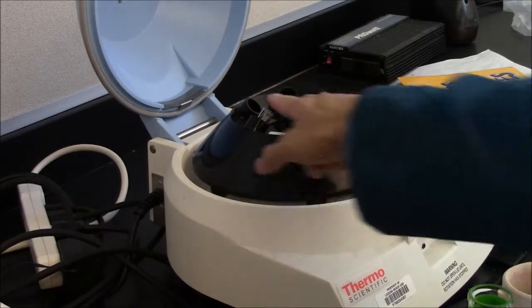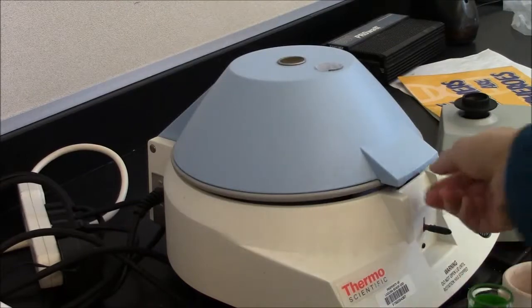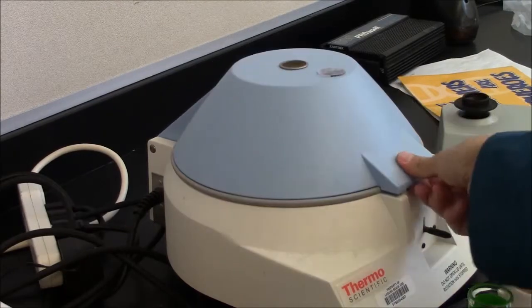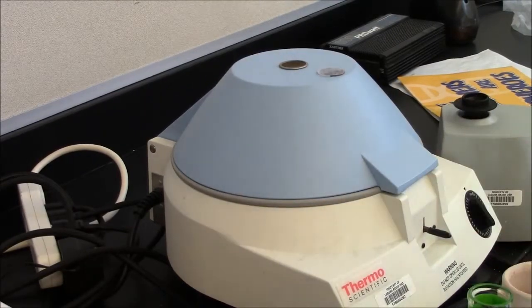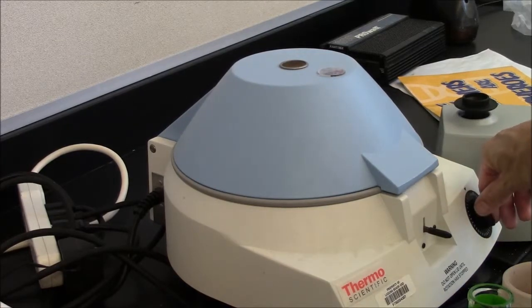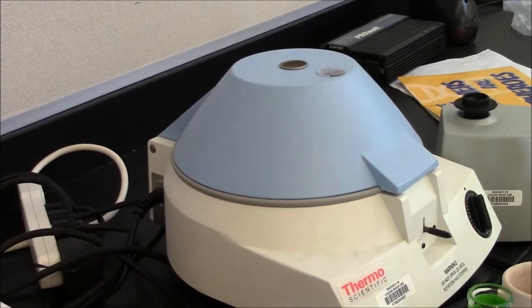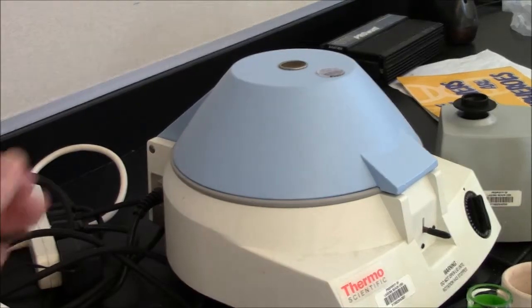To operate the centrifuge, I put my tubes in, close the lid, make sure it's securely closed. Then I turn the dial. It's a timer in minutes. It's now speeding up.